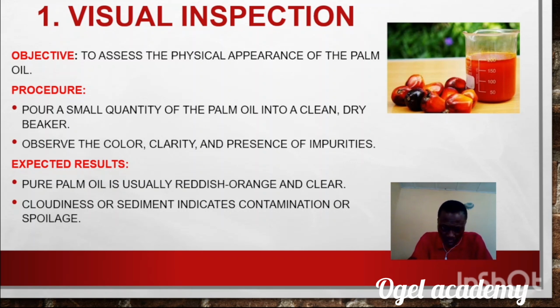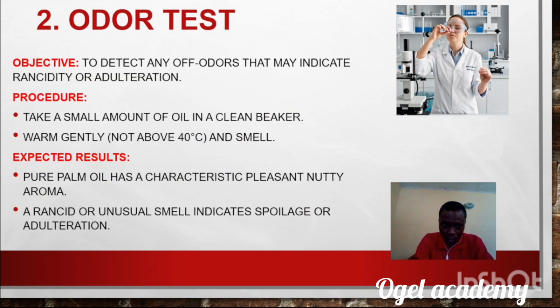The expected result is that pure palm oil should be reddish orange and clear in appearance. Cloudiness or sediments will indicate contamination or spoilage.